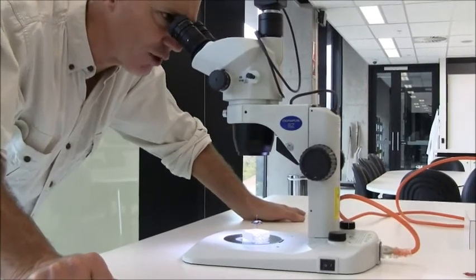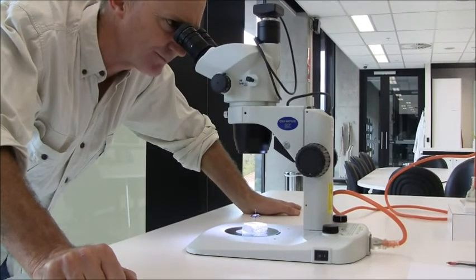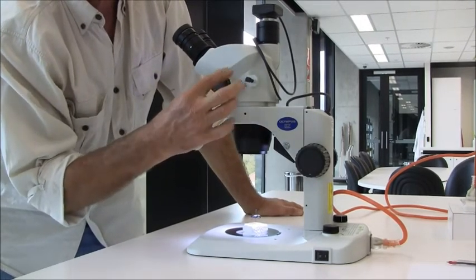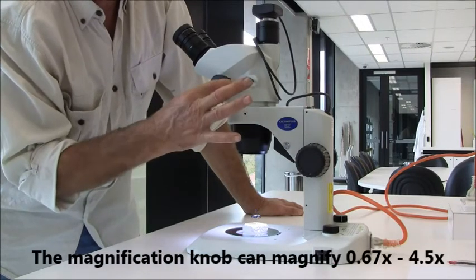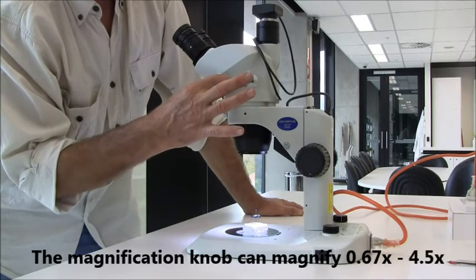Looking down this microscope, that little beetle is magnified 6.7 times. But you can adjust the magnification, and it's a continuum. Whatever is needed, but it goes from 0.67, through 0.8, through 1, 1.2.